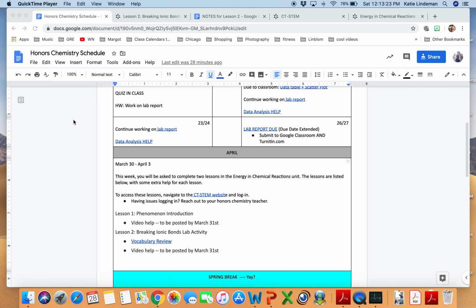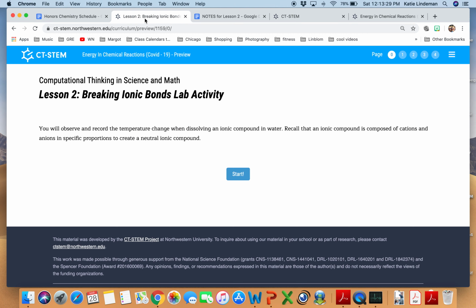In this video, we'll talk through Lesson 2, Breaking Ionic Bonds Lab Activity. Again, we want to click on the CT STEM website and navigate through it to get to the lesson. Lesson 2 is called Breaking Ionic Bonds Lab Activity. You will observe and record temperature changes when dissolving an ionic compound in water.